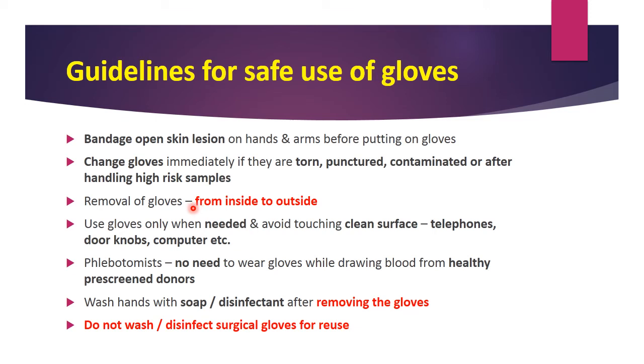Removal of gloves is also very important. It should be from inside to outside. The outside surface should not come in contact with the inside surface while you remove the gloves after usage. Use gloves only when needed and avoid touching clean surfaces. Only when needed should you use them, and avoid touching clean surfaces like telephones, doorknobs, computers, etc.